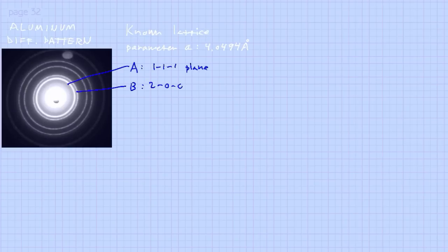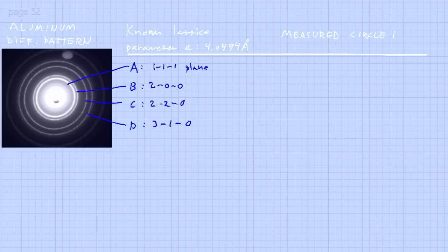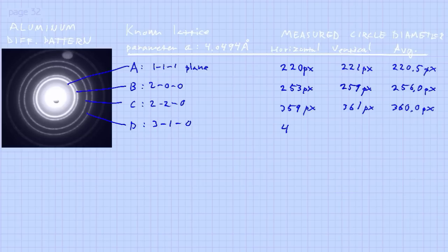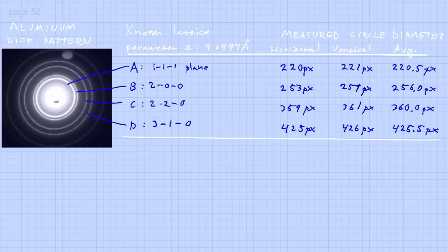So we have a diffraction pattern from the aluminum calibration sample and the molybdenum trioxide. We're going to measure the diameter of the four inner rings in the sputtered aluminum pattern. If you measure the horizontal diameter of the inner ring you get 220 pixels, and in the vertical direction 221 pixels — essentially the same. However, the second inner ring gives 253 pixels horizontal versus 259 pixels vertical. This discrepancy is caused by astigmatism of the system — of course the circles should be completely round.